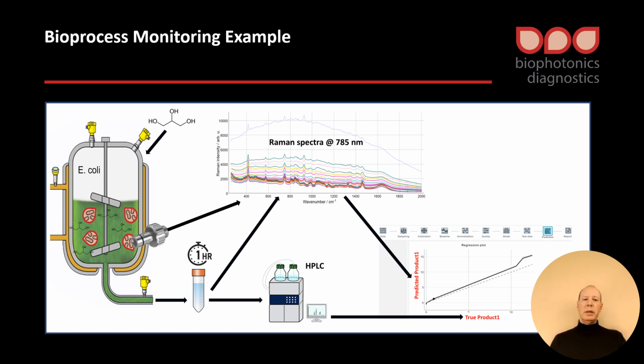In some runs we also did inline measurements directly in the process by putting the sample probe into the bioprocess via a viewport, and also every 1 hour we took a Raman spectrum from the current mixture in the bioreactor. And all the data were analyzed by our software.